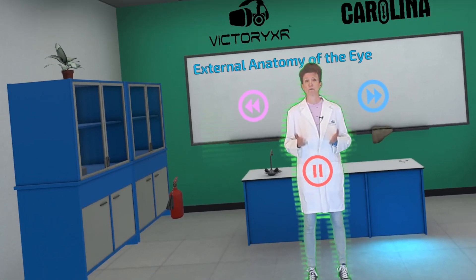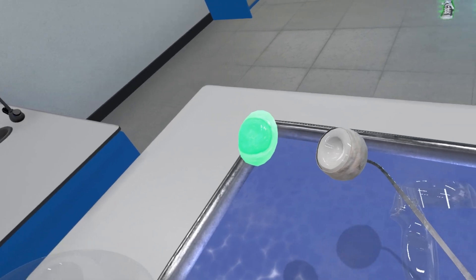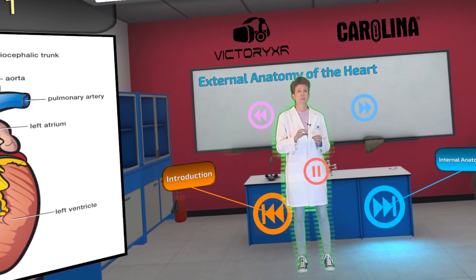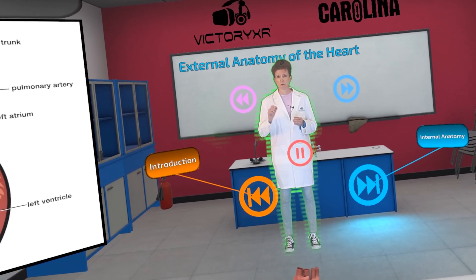Separate the eye into two halves with forceps. Touch the left atrium with your probe, then the right one.